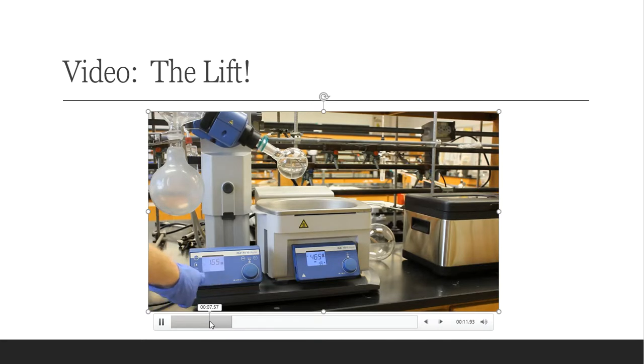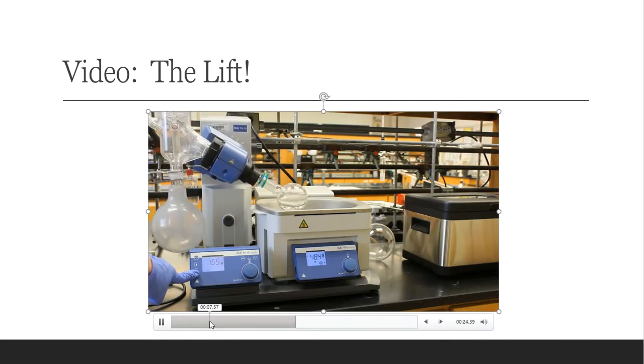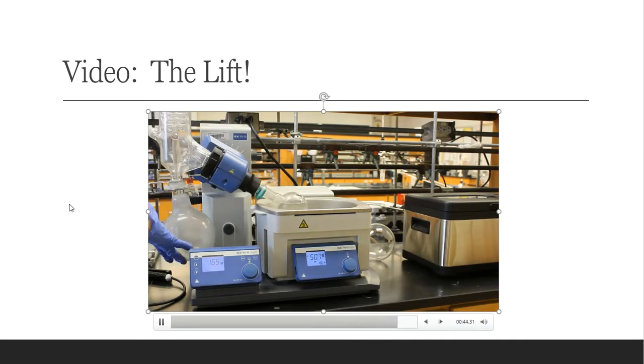Over here to the left-hand side, there's a button that's called the lift, and it's basically the elevator for the flask. I'm just going to slowly hold down the lift button. You're going to see a very noisy elevator and the flask getting lowered inside of my water bath into the vat. All right, so I'm going to keep this in here, and it's going to slowly heat, slowly evaporate. All of the vapor will go from here across through the reflux condenser and down into the receiving flask over here to the left.